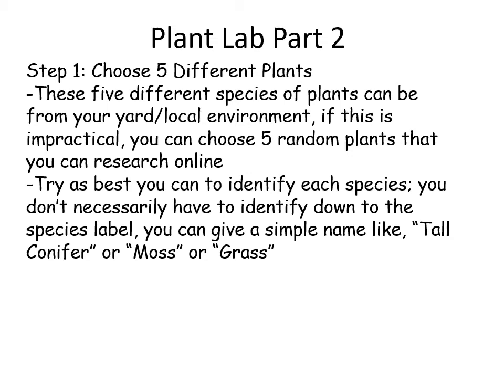Okay, so in the last lab that we did, you started looking at plants, different characteristics that plants have. And in this lab, we're going to do a similar activity to what we did early on in the semester with the insects. So we're going to have some plants, and then we're going to look at certain binary characteristics and kind of use our plants to fill out a table of characteristics. And we're going to build on that.